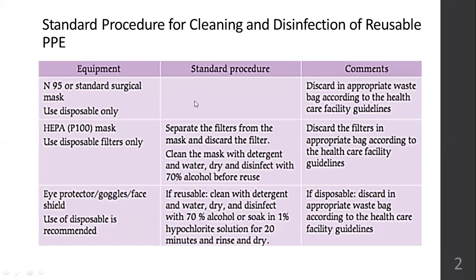Okay. Then HEPA filter, this P100 mask. Just like we have N95, there are N100, P100 masks. So they are more robust in their structure, but their filters can be removed. You can put new filters every day. So only dispose the filters.